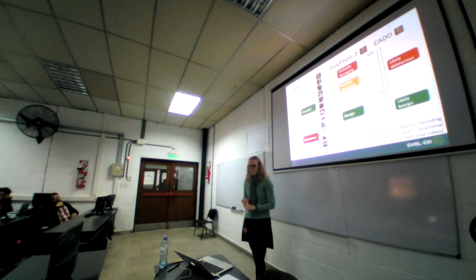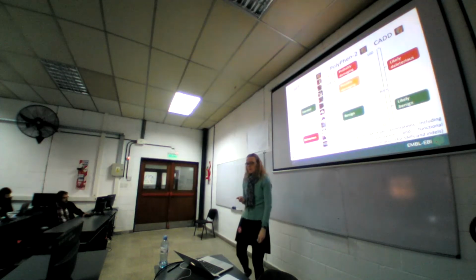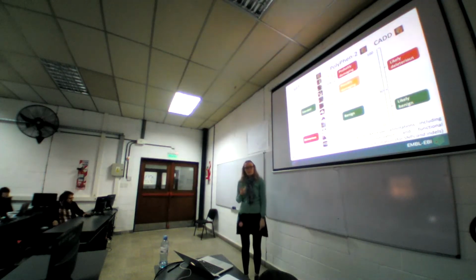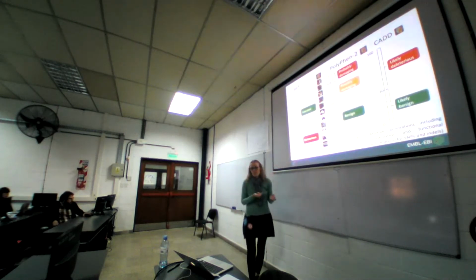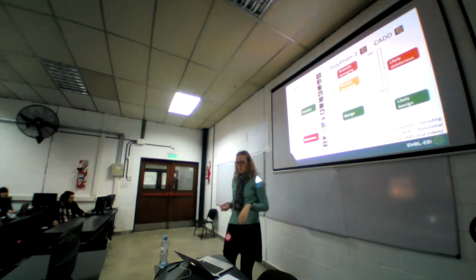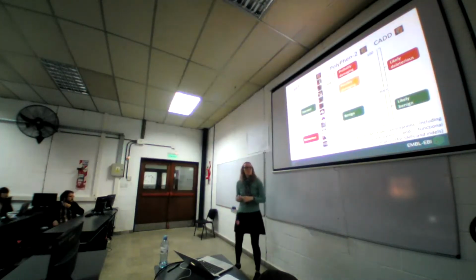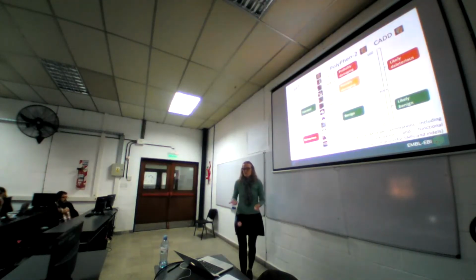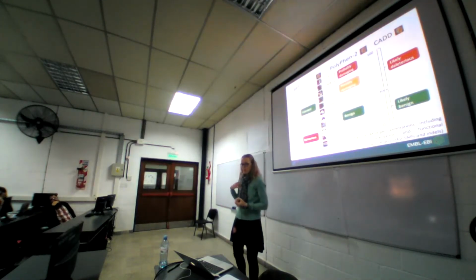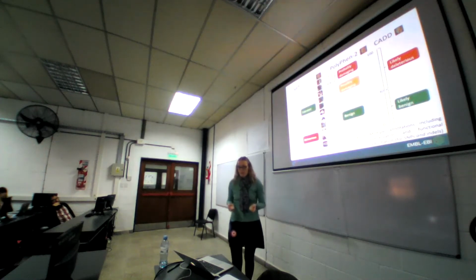They use a scale from 0 to 1 or 0 to 100, and different methods which are outlined at the bottom. SIFT, for example, uses sequence homologies and chemical similarities of amino acids. So for SIFT, if you have a change from a leucine to an isoleucine, it would have a score near 1, which means tolerated, because they are quite similar biochemically.